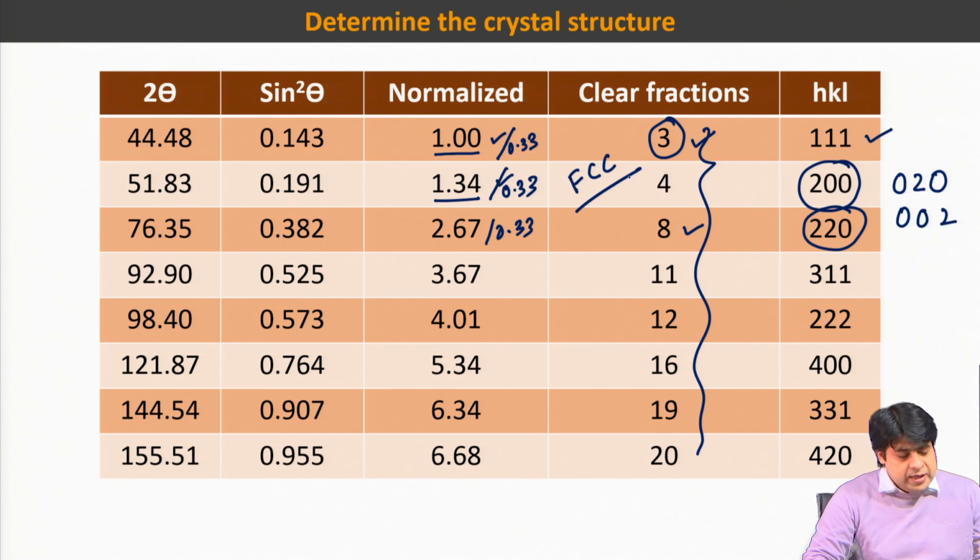what you can do is easily check, suppose you have quartz. You should see that quartz gives a reflection close to this 2 theta value, and you should also see the intensity. From the archive you should see which 2 theta value gives the maximum intensity, and if your unknown sample gives the maximum intensity close to that 2 theta value, then your material is whatever the archive says. So, it could be quartz or whatever material you have.